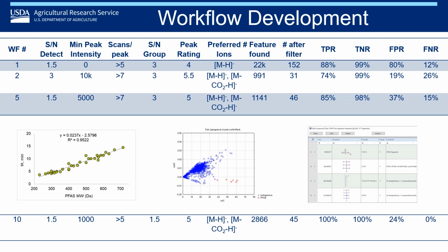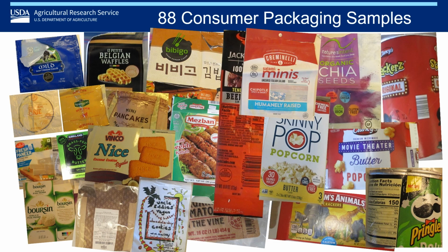Following the validation of this workflow and filter method, we then sought to use it on the same 88 consumer and packaging samples that we did targeted analysis on and what was presented in Yelena's talk previously.